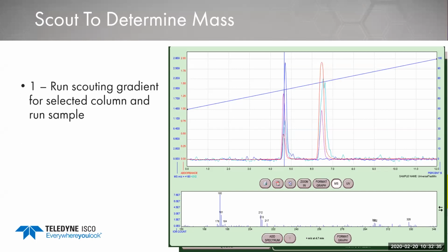And am I aware of a failed tune using the Adducts software? That is actually a very common question. The tunes could potentially fail. Why do they fail?